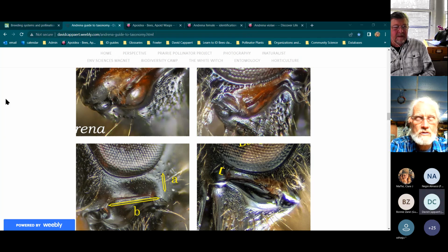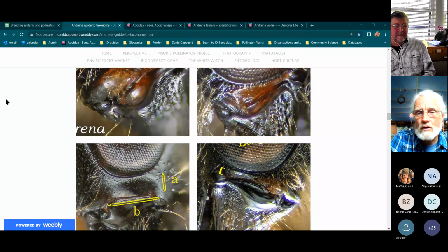And you have actually two condyles on the far side. Those are like the things that curve in and grab into the structure of the integument. And then you have an offset lump in the middle. And this gets very confusing because no one tells you these things. That offset lump is muscle, and it's pulling on the rim of the mandible to open and close it. But when you're looking at it, it's like, where exactly am I measuring? To the outside of the condyles, to the lump, to the condyle?